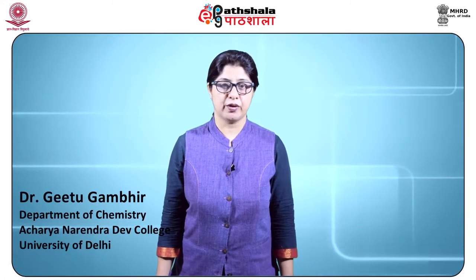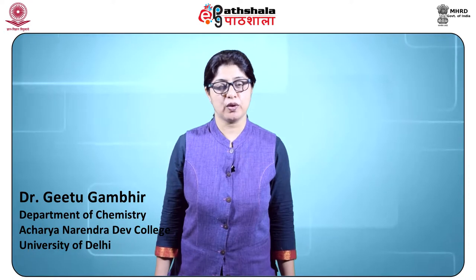After studying this module, you shall be able to know about thin layer chromatography, high performance thin layer chromatography, the instrumentation and working of the apparatus, and the applications of TLC and HPTLC.